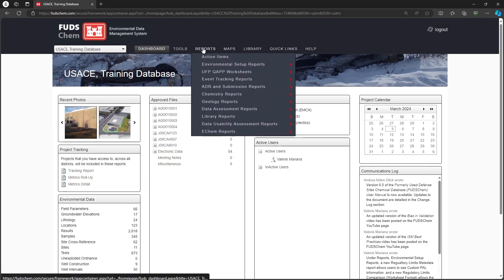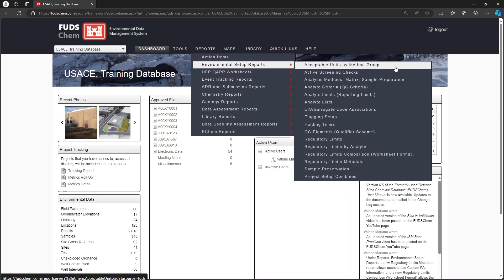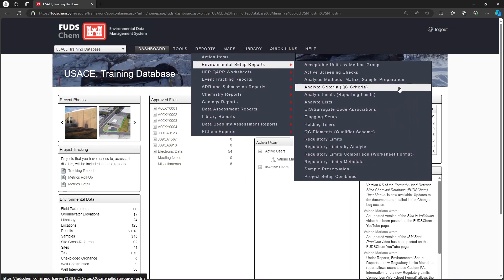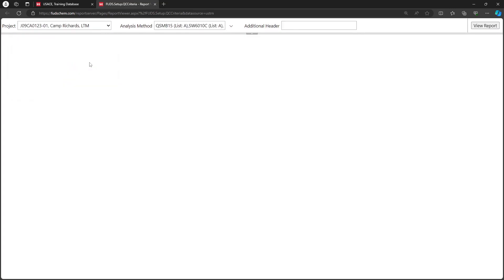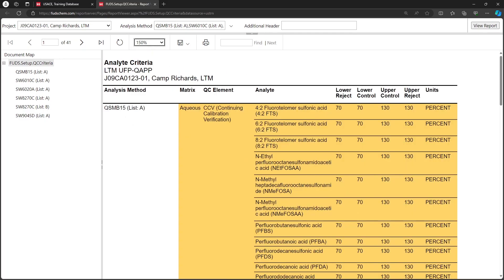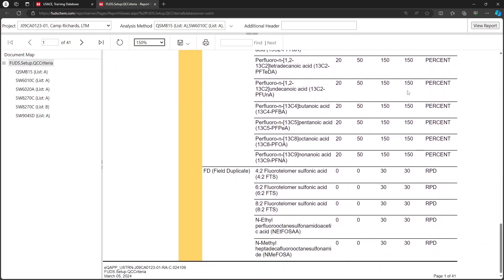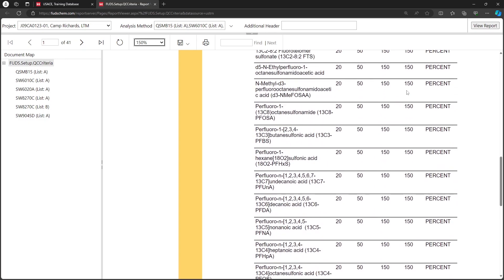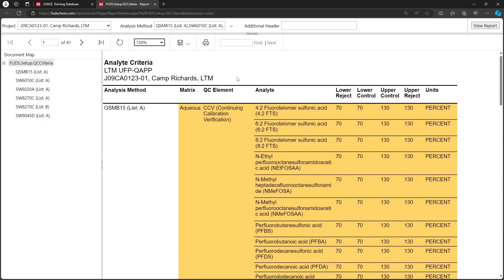Go to Reports, Environmental Setup Reports. Choose Analyte Criteria, choose the project, adjust the Analysis Method drop-down if desired, then click View Report. This report shows the QC elements required by the EQAP for each analyte in each method. It indicates which compounds are set to be included in matrix spikes, laboratory control samples, etc. Submitted laboratory data must match this list exactly, so it should be reviewed carefully to make sure no elements or analytes are missing and that no extra items are included.